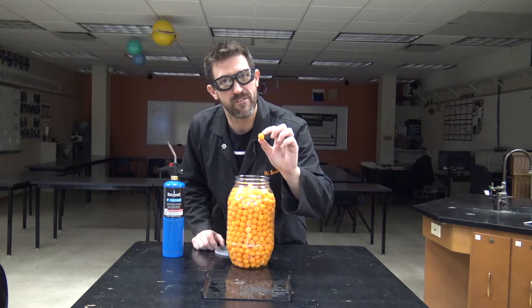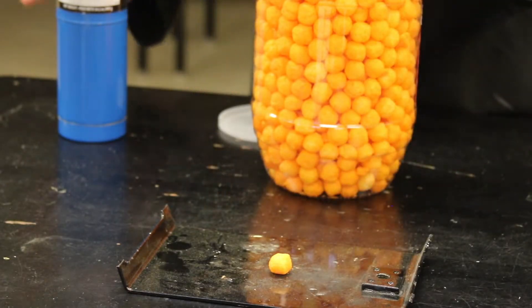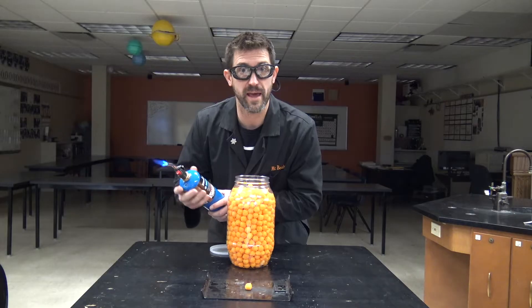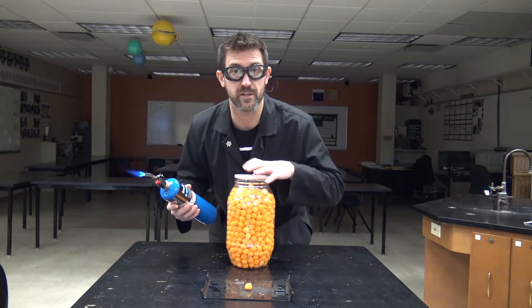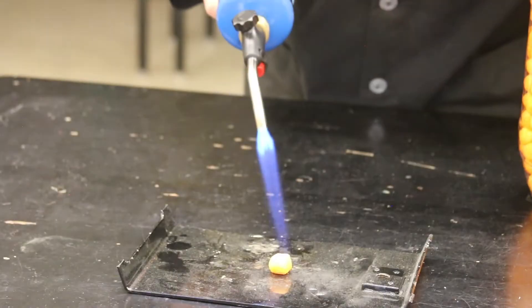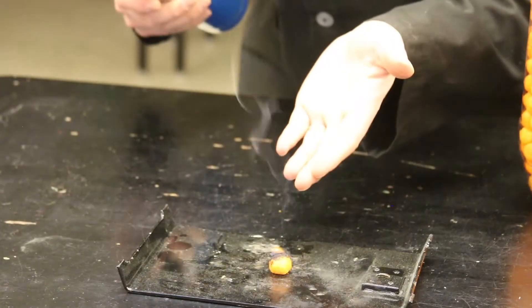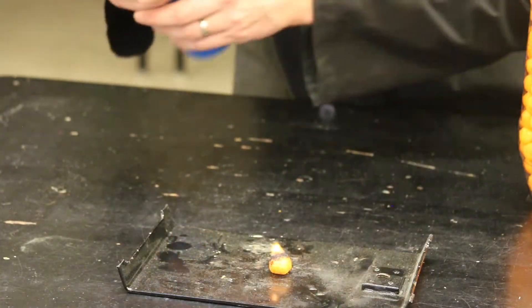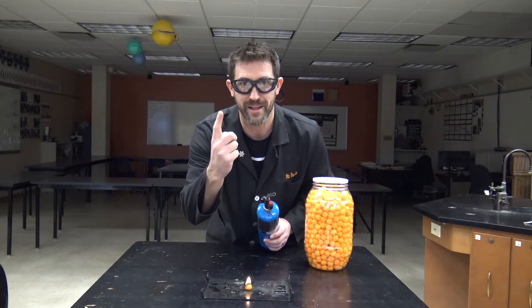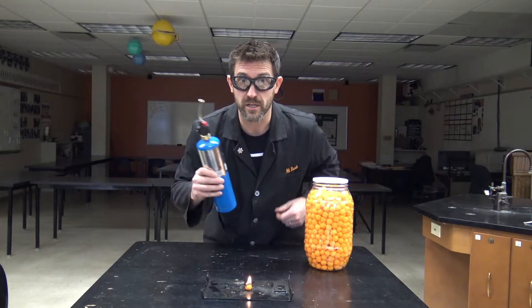Let's start here with a cheesy poof. Cheesy poofs have carbohydrates and oils and fats, so they are flammable. If we look at the label on the back it tells us just how much energy is in there, because that's what calories are. So I light this thing and it will burn, sort of. Part of the problem is there's just not a lot of oxygen getting in there to get it to burn really well. Well, I think we've just solved that problem because we've made ourselves liquid oxygen.